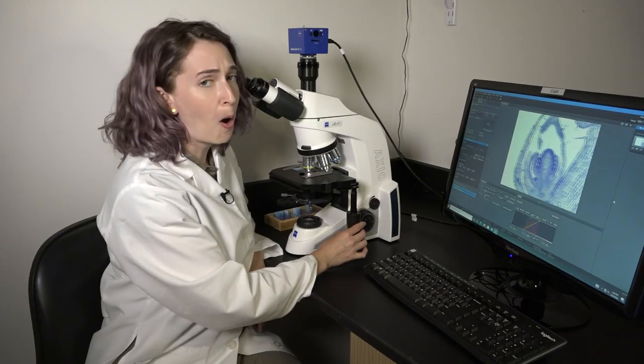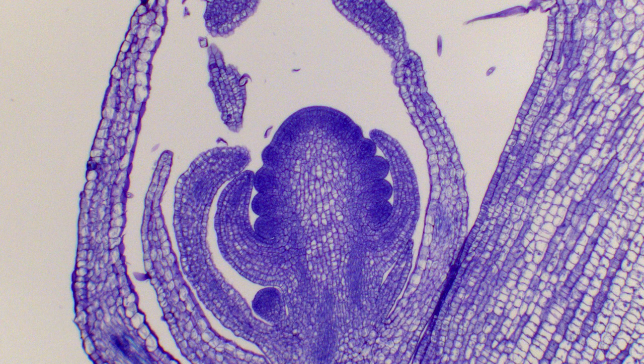And oh my gosh, look at this teeny tiny flower bud. Oh, it's so early in development that all of its organs are just little nubbins at this point. I love it when microscopy is cute. Well, that concludes our brief tour of how to make a microscope slide. The next time you look at one in biology class, I hope you'll take a minute to appreciate the effort and artistry that went into creating it.